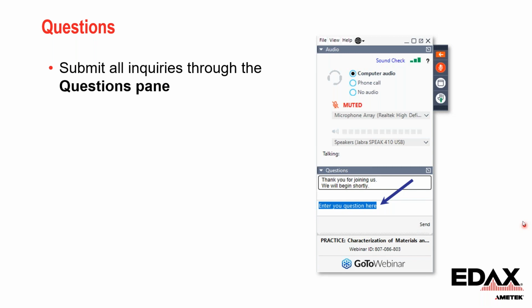This question is, is WDS required to separate overlapping EDS peaks? Yes, because EDS has poor energy resolution, those peak overlaps cannot be resolved. And the much better resolution of WDS can resolve those peak overlaps intrinsically.